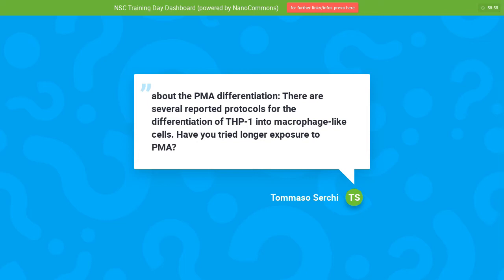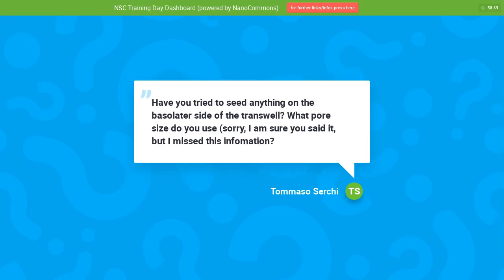For another project we're doing within Patrols, we're actually using a 5-day differentiation protocol for the THP1s with a 3-day recovery phase. So we are using different exposure methods within Patrols, but for this model, it's a 48-hour PMA exposure and then a 48-hour recovery period.